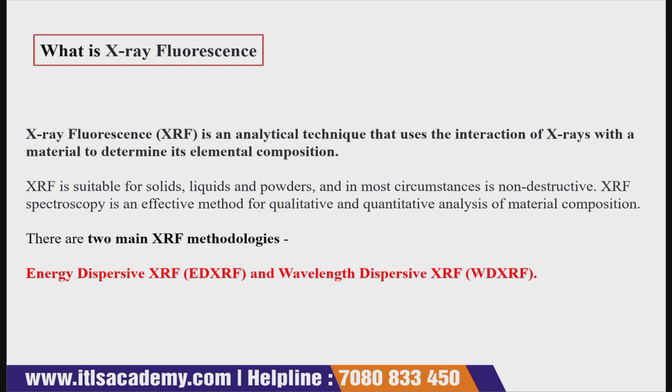Now let's move to the next and see the details of what X-ray fluorescence is. I already told you that X-ray fluorescence can also be known as XRF, and it is a non-destructive analytical technique. Here the fluorescence refers to the emission of light from a molecule after the absorption of radiant energy.